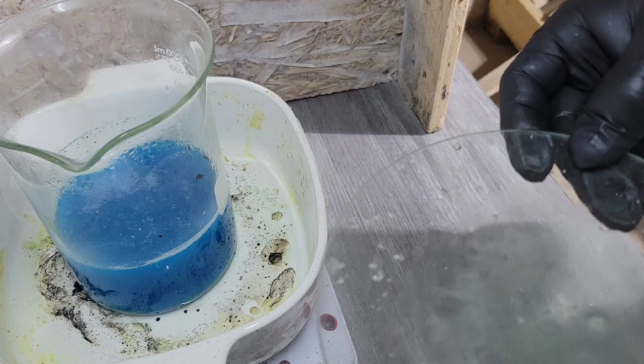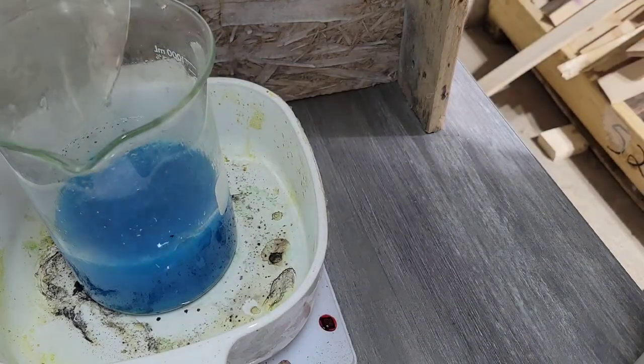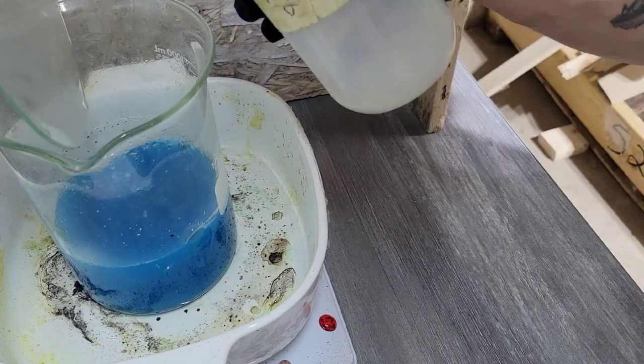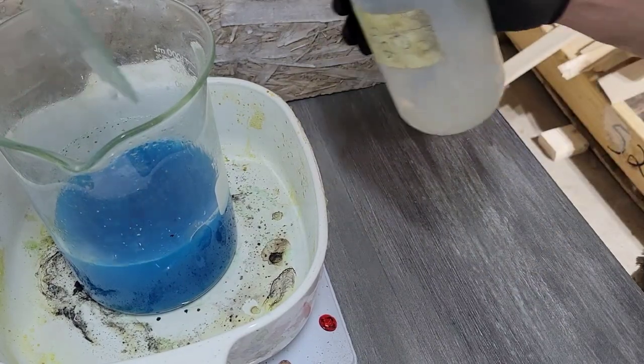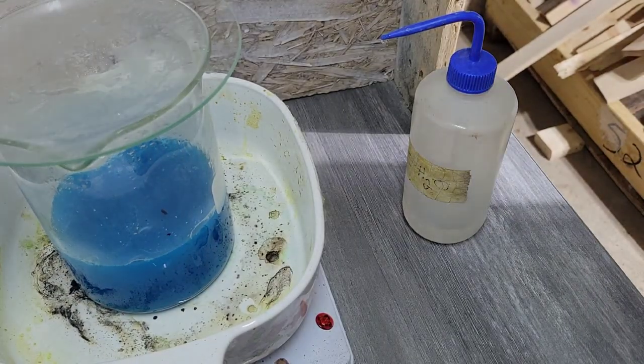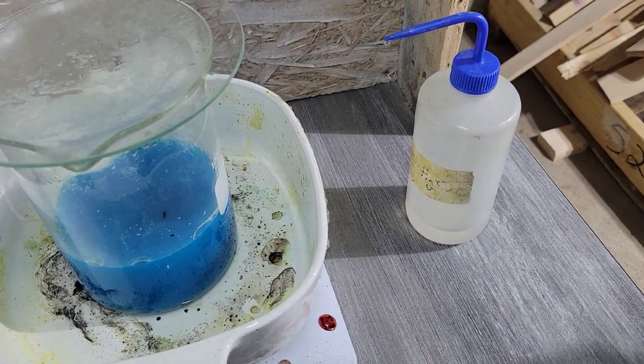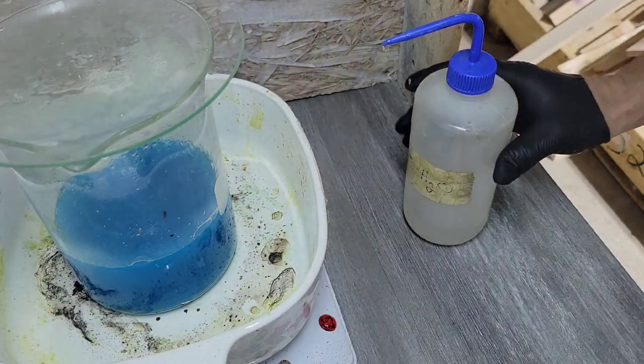See, we've got a little bit more cemented silver. So I know for a fact we're going to have more nitric acid in solution than that. They're still pretty decent sized.